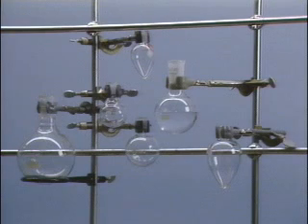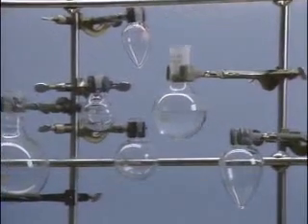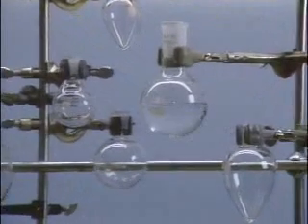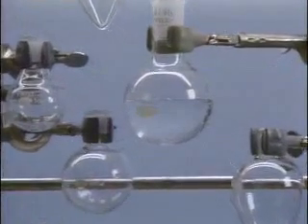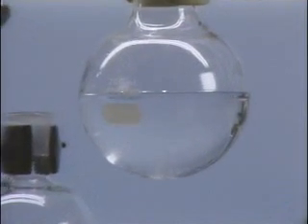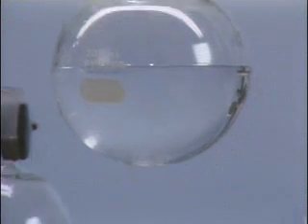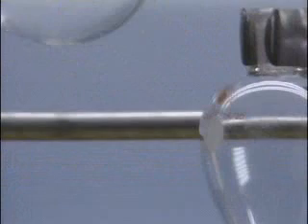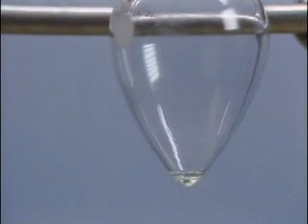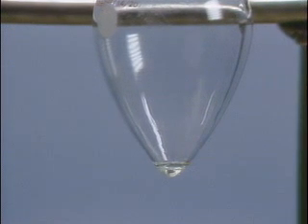Simple distillations are performed routinely in the laboratory with apparatus that is commonly available. The flask selected for the distillation should have a round bottom or a pear shape and be of such a size that the material to be distilled fills it between 1/2 and 2/3 full. These flasks have advantages over flasks with flat bottoms. First, the material will be heated in a uniform manner, and the possibility of localized heating is reduced. Second, as the material is boiled away, the material that is left will be concentrated at the bottom of the flask and not spread out over a large surface area.